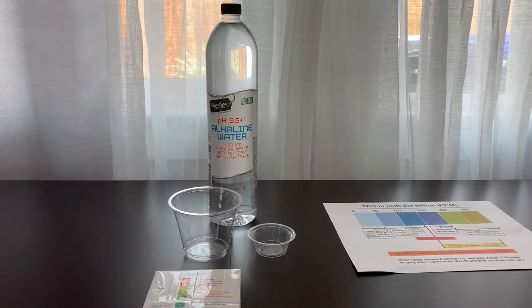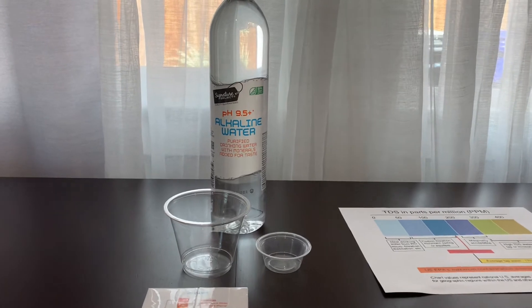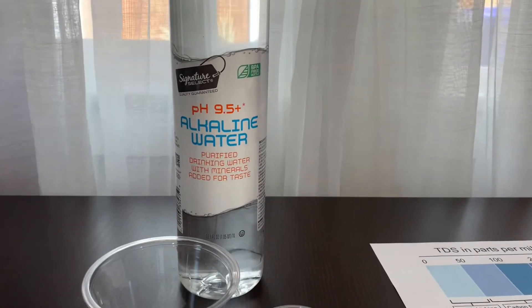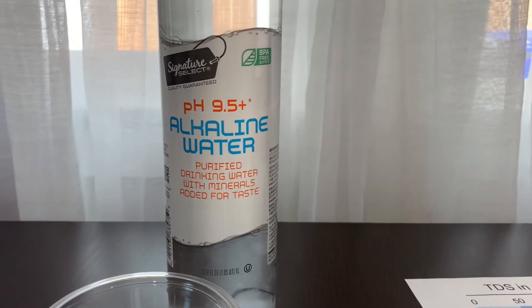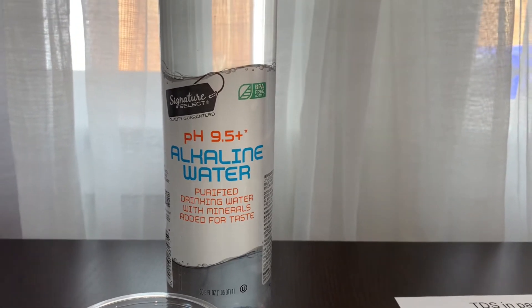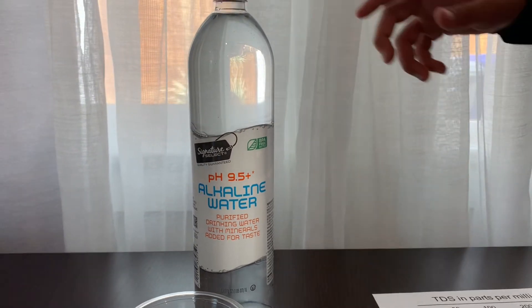This is Signature Select purified alkaline water with minerals added for taste. It's processed by electrolytes and reverse osmosis. The bottle is made from BPA-free plastic. The pH is supposed to be 9.5, and it costs $1.45.